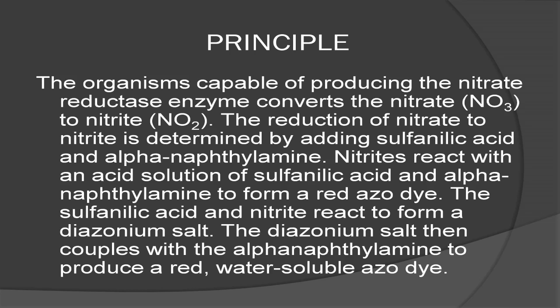In each of the test reactions, the appearance of the red dye indicates the presence of nitrite in the test tube, whether as an unreduced primary substrate, a product of the reduction of nitrate by the test organism, or a product of the forced reduction of nitrate with a reducing agent, zinc, for control purposes, indicating a negative test result for nitrate reduction by the organism.